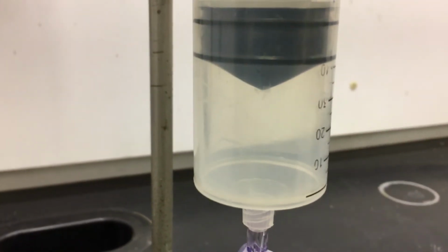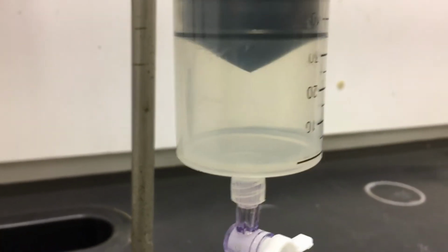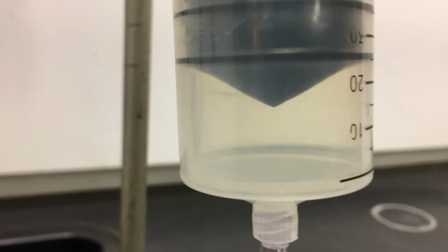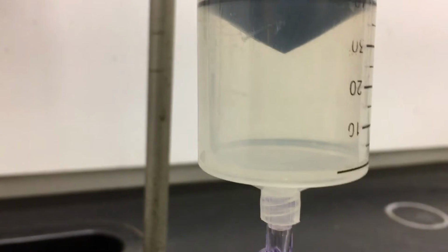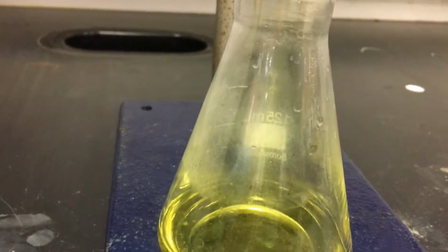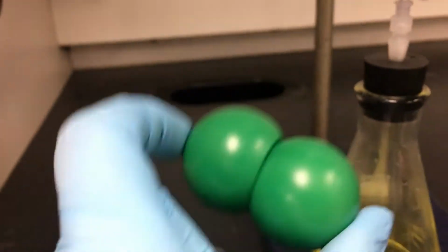I've also been trying to collect it up in the syringe here, but again, it's very faint. So unless you get a very concentrated amount, which is dangerous, it's hard to see. So you might just have to kind of take my word on it. But maybe if I move it like that, you can see the yellowish green there. Okay, so this chlorine is a gas at room temperature. It looks something like this as a diatomic molecule.